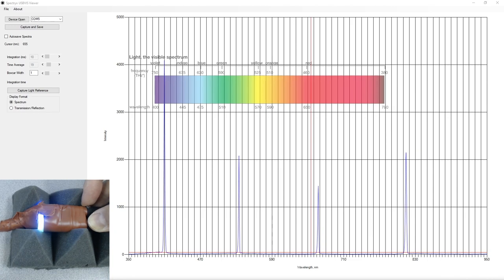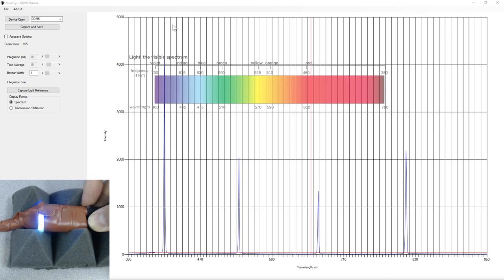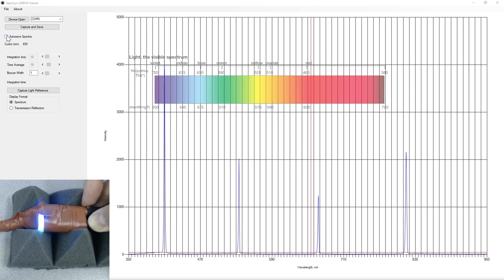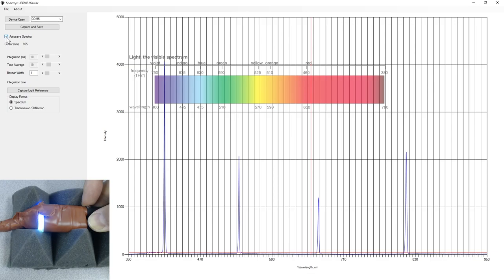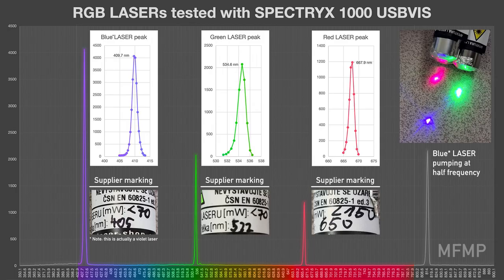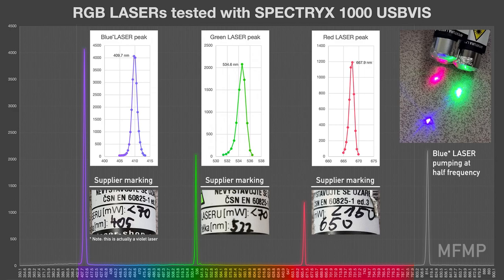I'm just going to capture that and I will post into the blog on remoteview.icu the spectra that we capture here. And we'll see the respective nanometers captured by the Spectrix USB Viz across these RGB lasers. So we'll do that and that's just going on in the background there. Okay, so there we have it. Thank you very much for your time.